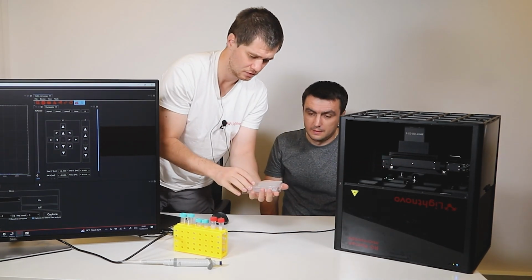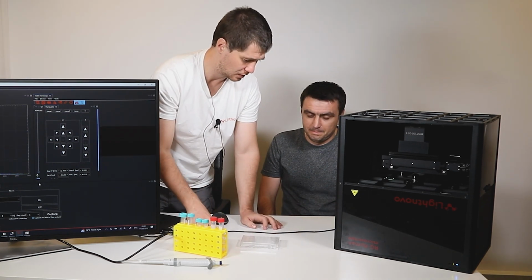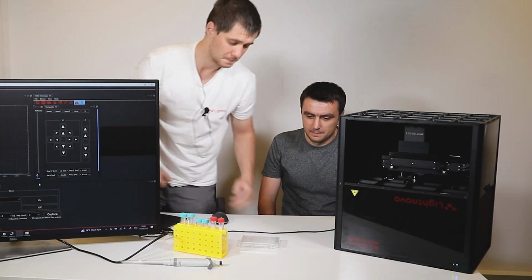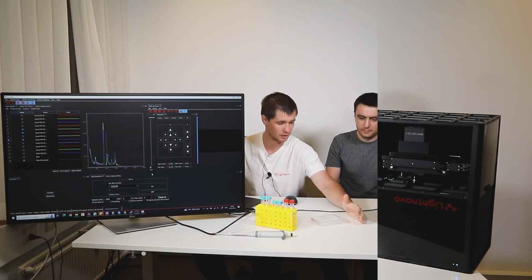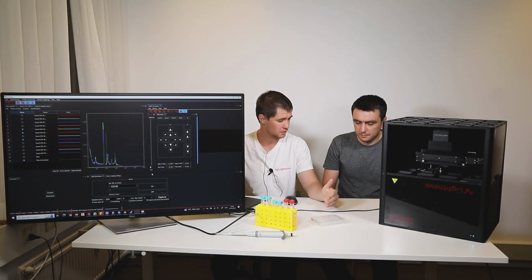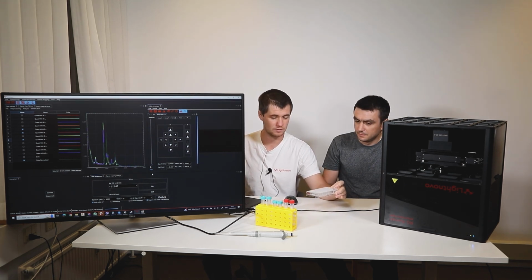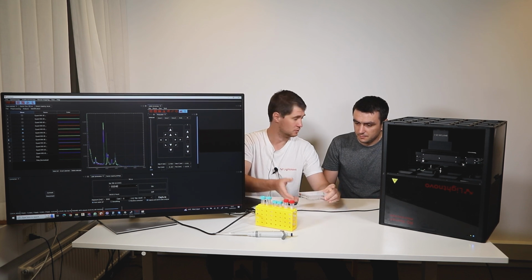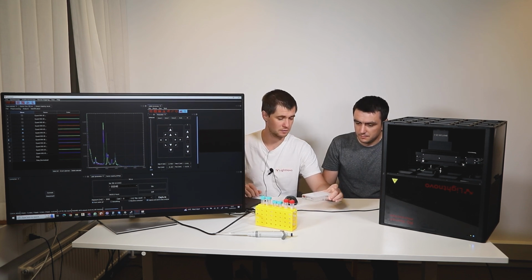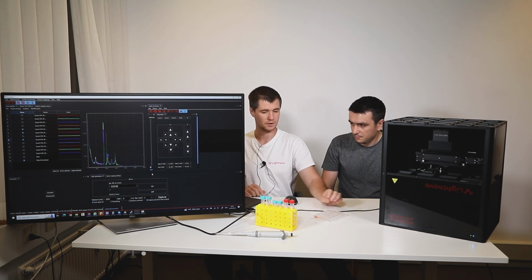We remove the plate, and we can load a new data set and continue. This is how you can do automated liquid sample measurements, calibration and quantification, and basically you can decide any multi-well format you want, 48 cell, maybe 96 and so on.